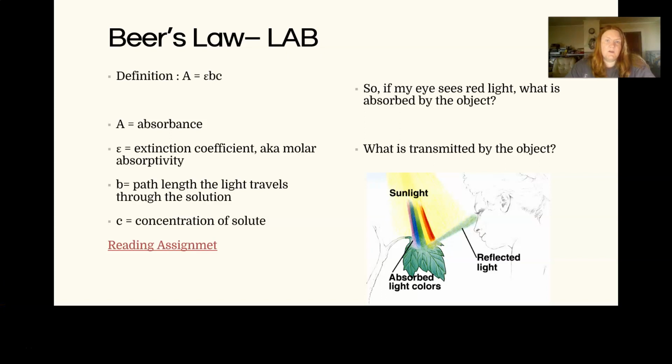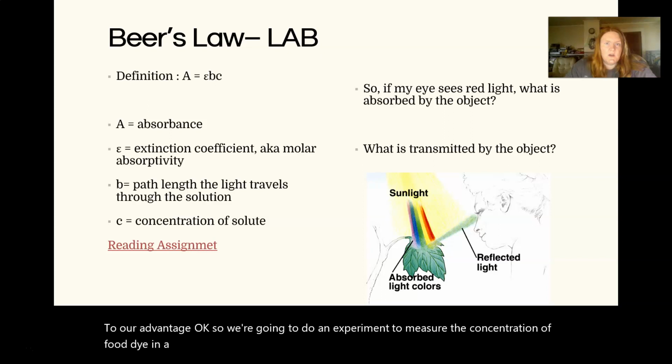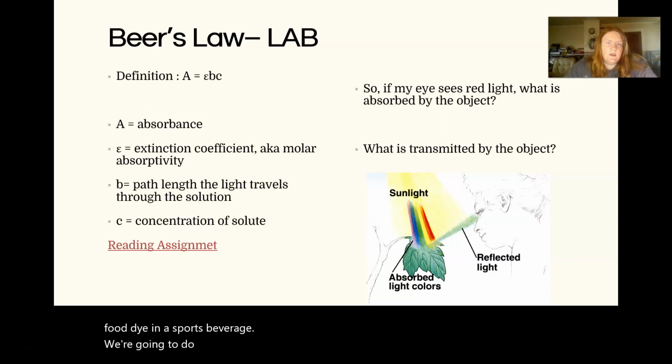So in lab, we're going to use the wave nature of light to our advantage. Okay, so we're going to do an experiment to measure the concentration of food dye in a sports beverage. We're going to do that using a strategy called spectrophotometry.